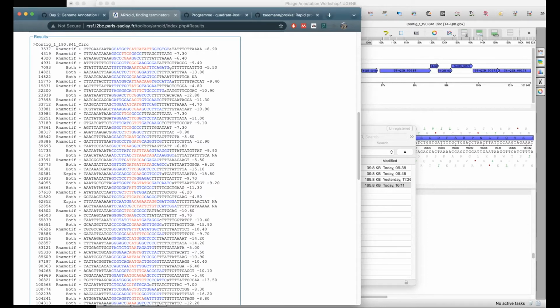One of the things that he does is use a program called Vibrant to identify the prophages, and then if you have your prophage sequence excised artificially from your bacterial genome, you could just do whatever we're doing right now with the prophage genome. The thing is that you don't know whether the ends of where it was excised in silico are correctly predicted by the program. If that makes sense.